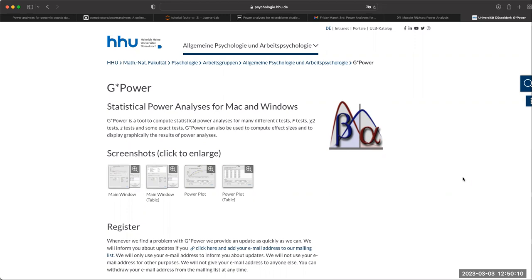Your sequencing depth is pretty much dependent on your budget. Usually people say, I want to sequence to like 30,000 reads or something. A question that comes up a lot is whether we can increase sequencing depth instead of increasing sample size, because it's much cheaper to sequence deeper than to collect more samples. But at least two or three papers show that sequencing depth only increases your power up to a certain point, like 30 million reads per sample. Sorry, 30 million. After that, your power doesn't change at all, so you need more samples.